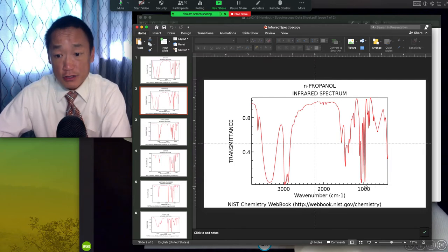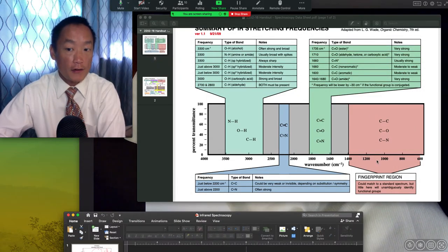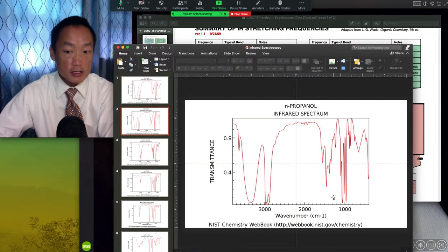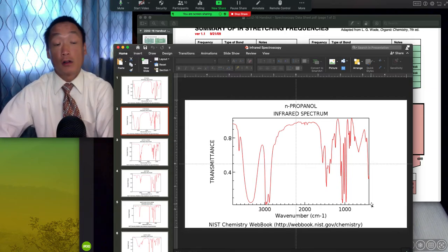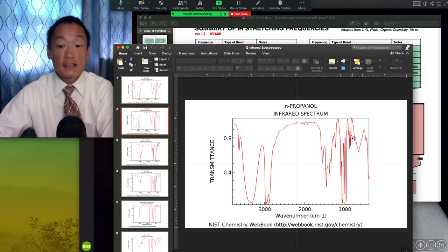And as a result, this region here is not very good at being diagnostic for what could occur in that molecule. If you look over here, I don't have any association to a certain type of bond in this entire region because, look, there's tons and tons of peaks that occur here. It's going to be really hard at your level, and even my level, for instance, to determine exactly what type of molecular motion is occurring in the molecule at these wavelengths of light because there's just so many of them here. This is a non-diagnostic region of this portion.